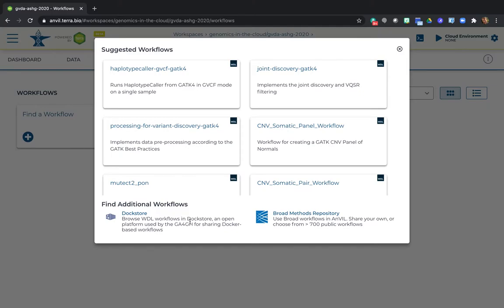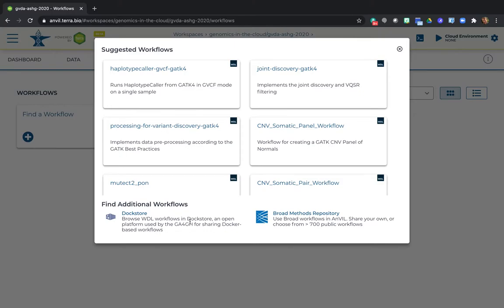For the purposes of our tutorial, the biggest difference between them is that the Broad Repository is mostly used by people who use Terra, whereas Dockstore is used by the bioinformatics community at large, so you can actually expect to find a wider selection of workflows there. There are also a few differences between them that are important for workflow development, but I'm not going to cover that here. Let's click on the Dockstore option.